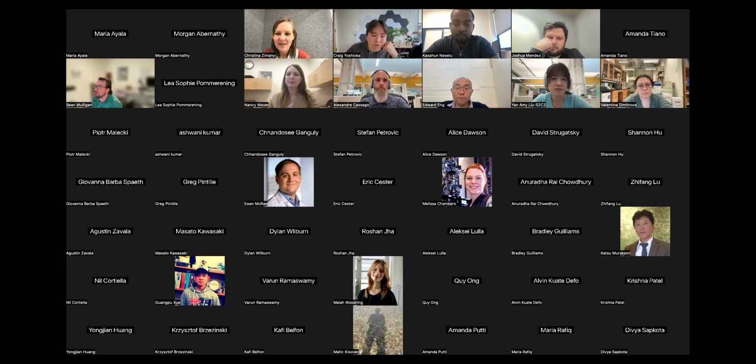Yeah, and you can put almost all these grids under a pretty cheap light microscope and actually see the surface and all the holes. When we've had issues like this in the past, I always want to check out the batch first, randomly sampling a couple of grids from a batch just to make sure they're not damaged before I even start working with them. Yeah, I've done that because we did get a light microscope, and they look fine before they come in, and I can actually see the little carbon piece on the filter paper.